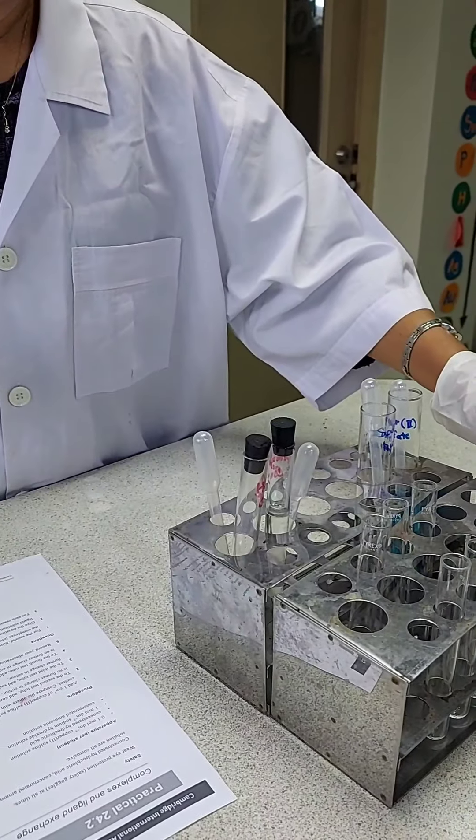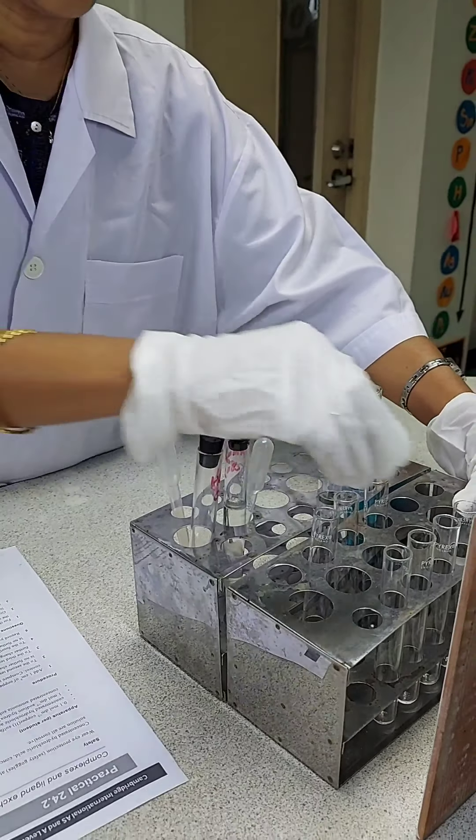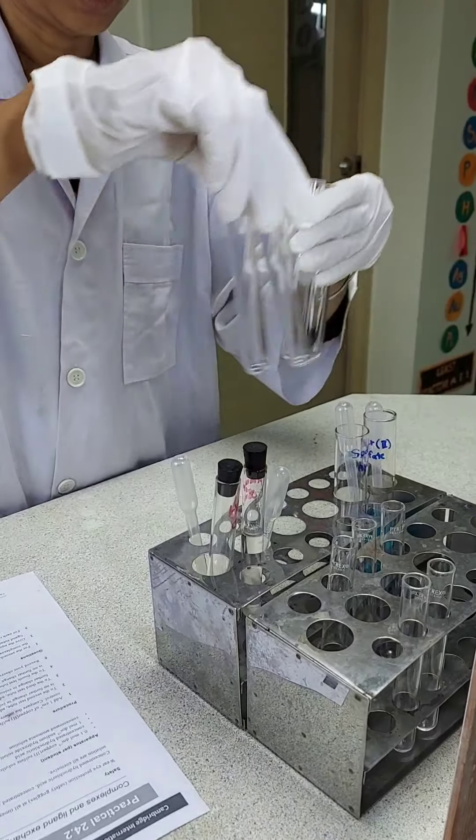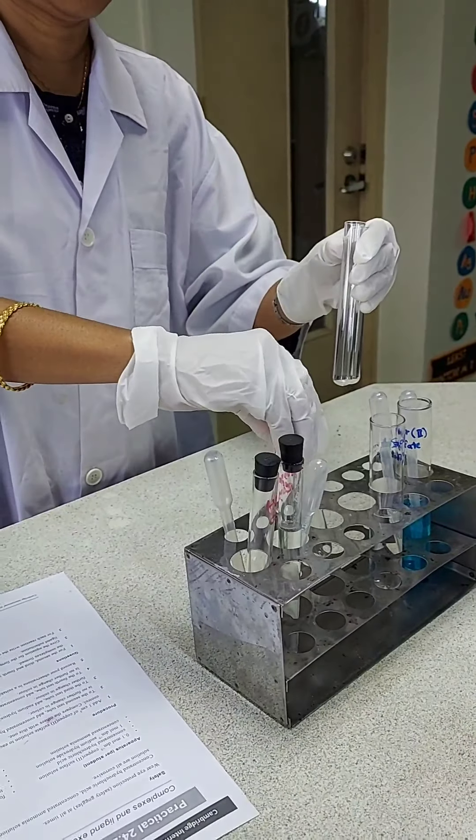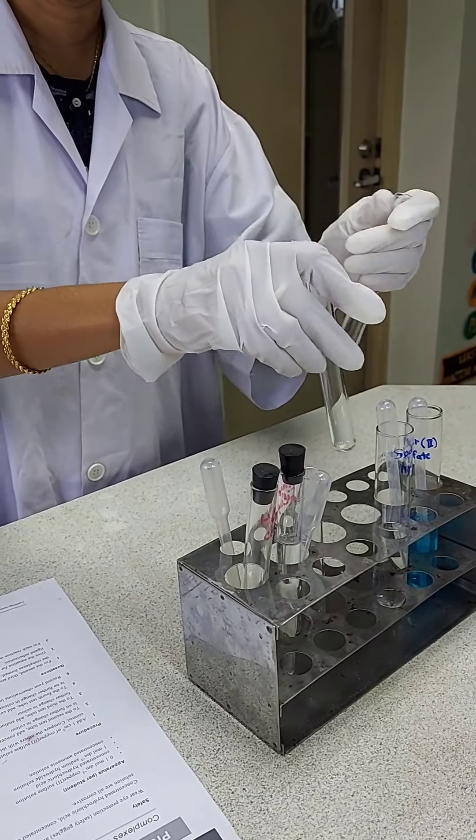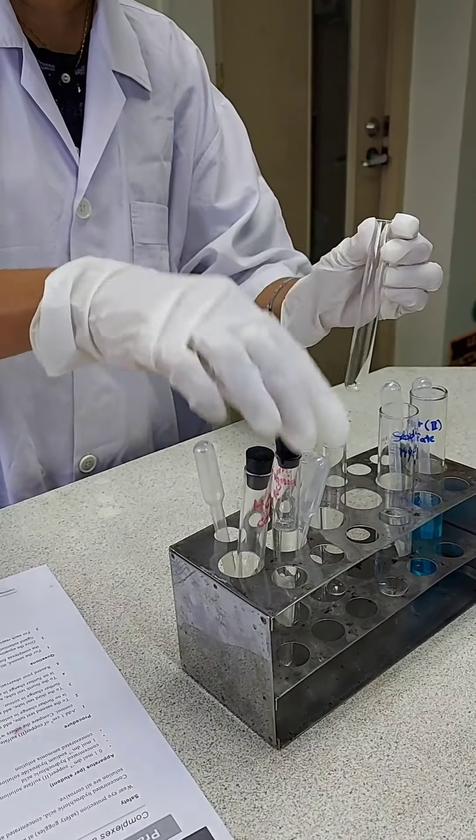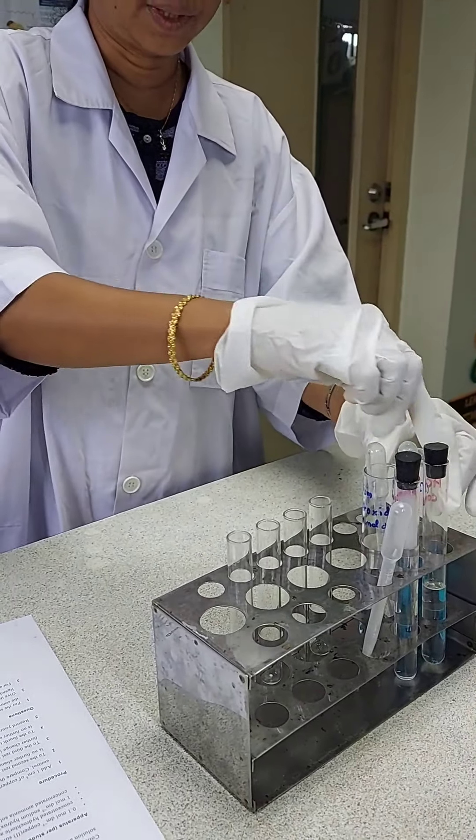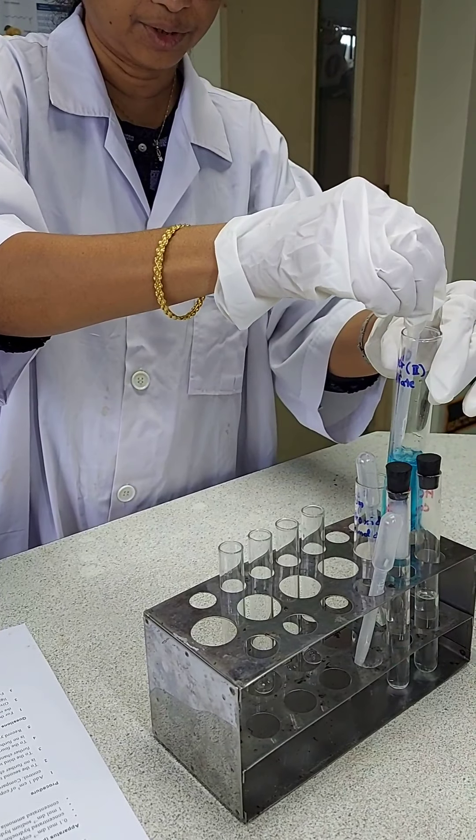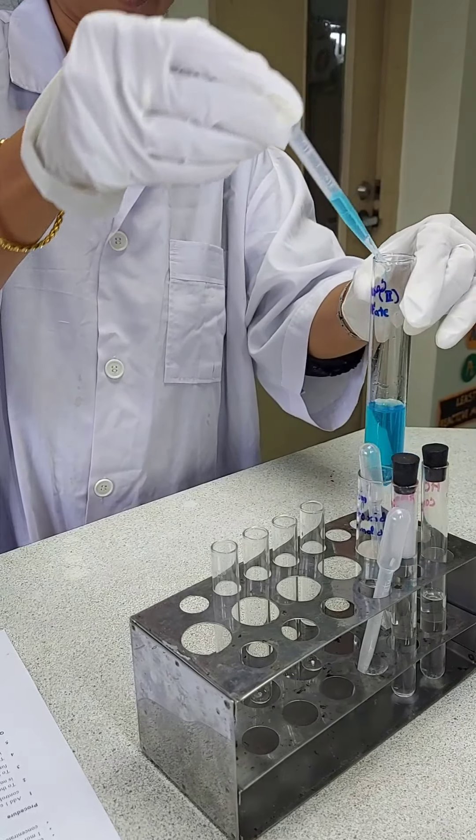What I'm going to do is take four test tubes and into each of the test tubes, I'm adding about 2 cm³ of copper sulfate solution.